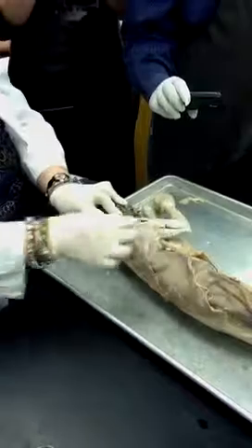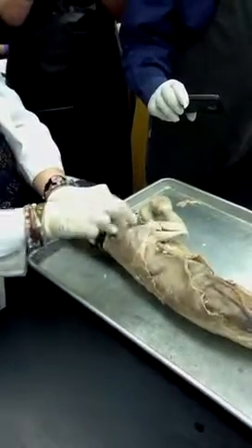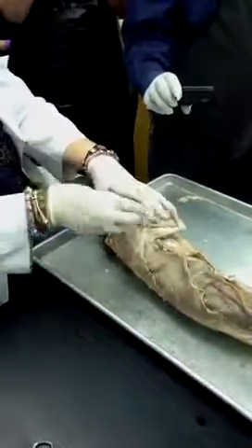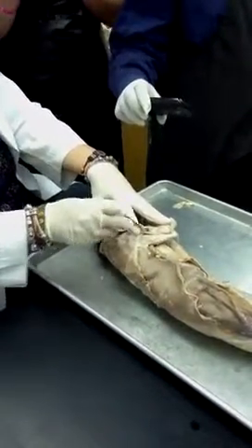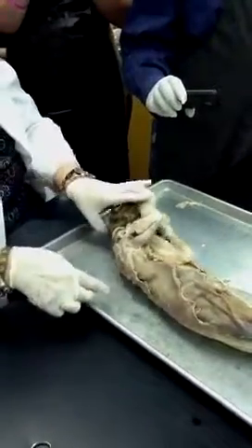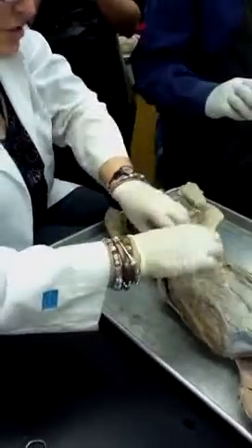Then we have our triceps. This is the long head of the triceps. This is the lateral head, which you transect to see the medial head. Right here, this little guy is the medial head of the triceps. Just a couple more things you could do, which we haven't done on this side: you could do the biceps brachii, and you could also see the serratus ventralis.